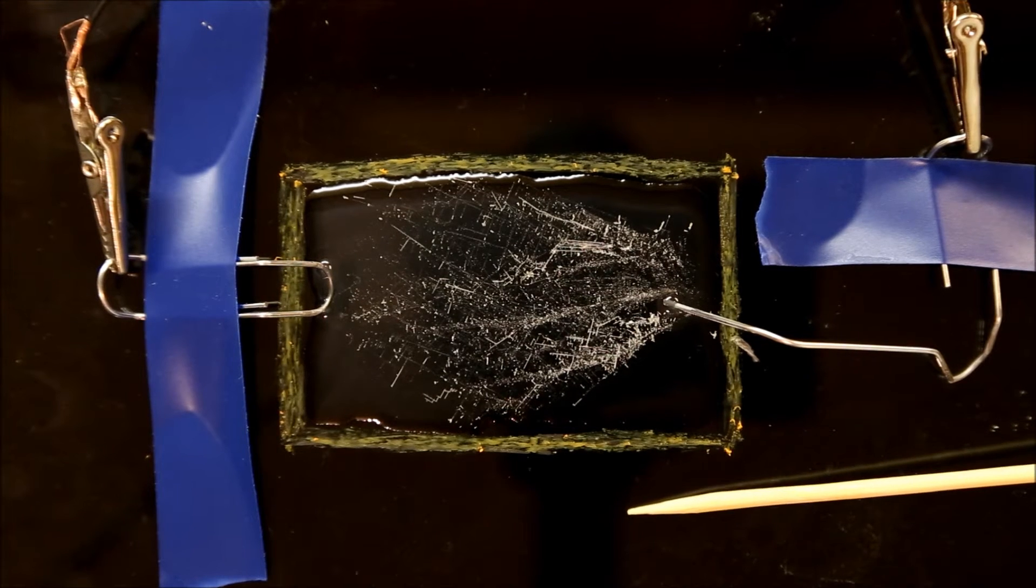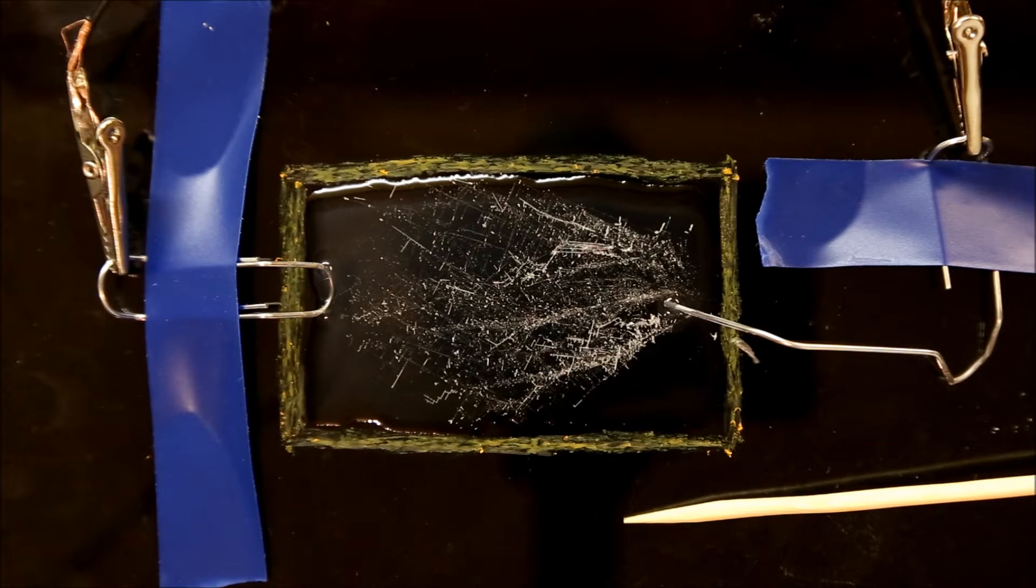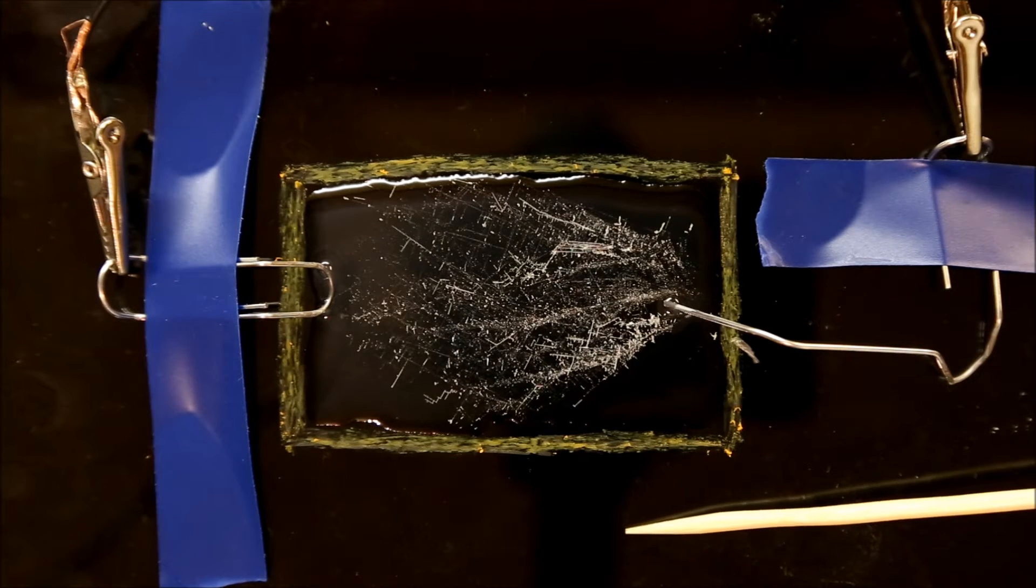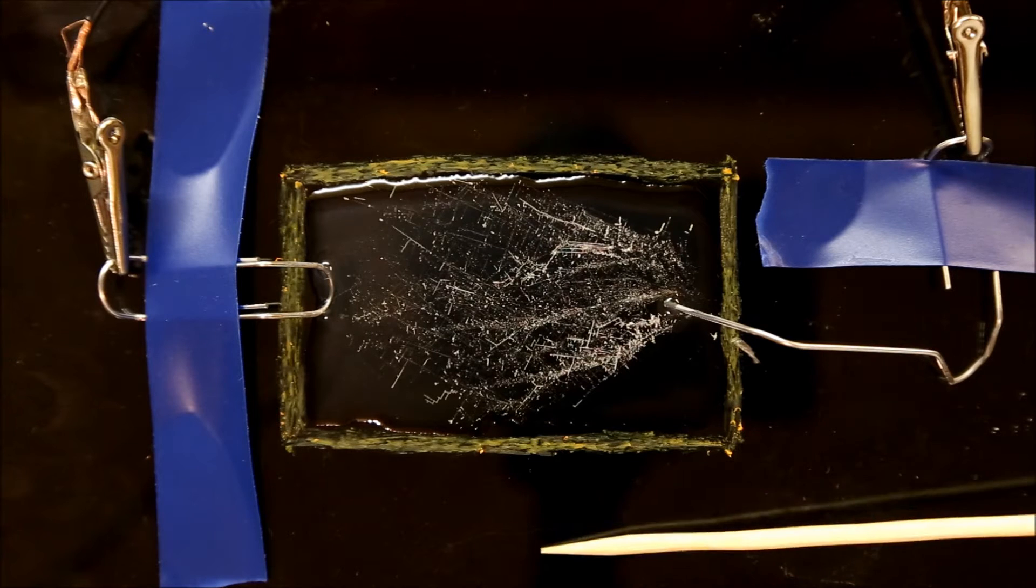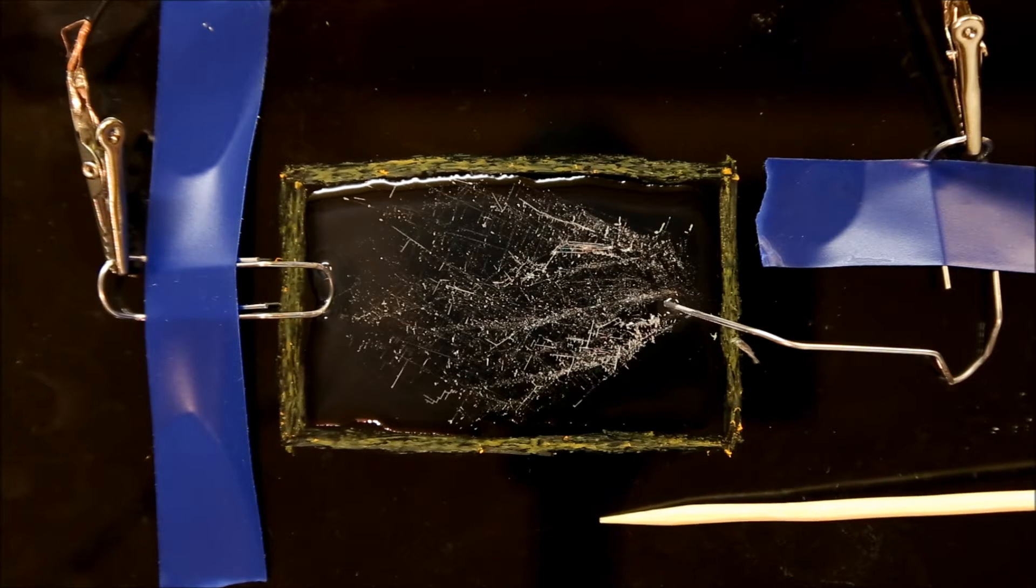I experimented with many different setups for growing tin crystals using electricity, and the one that worked best for me as far as producing the cleanest videos was to start with a piece of black velvet as a background, and place a sheet of glass on top of that.